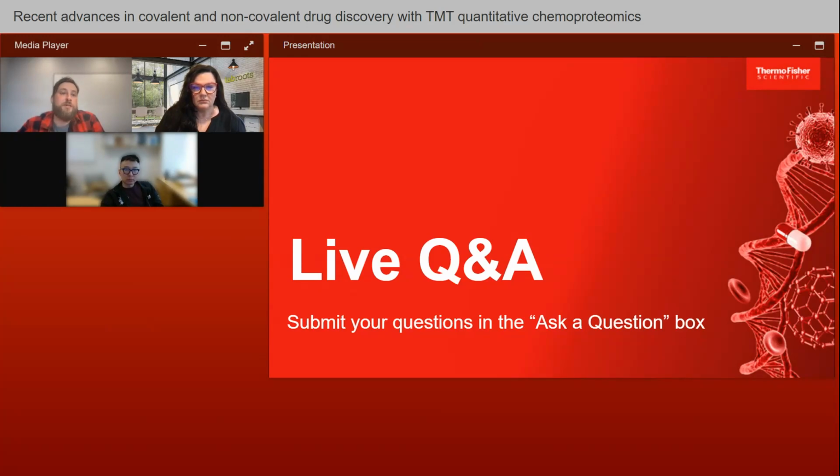So if you have just one, two, or a handful of compounds and you want to know the most information about them, I would go with TMT. However, if you want to go wide and investigate a series of compounds or a small library of compounds, then the throughput of DIA shines, and I would go with DIA.